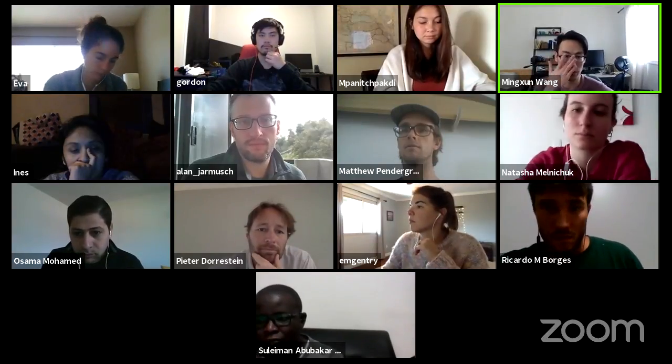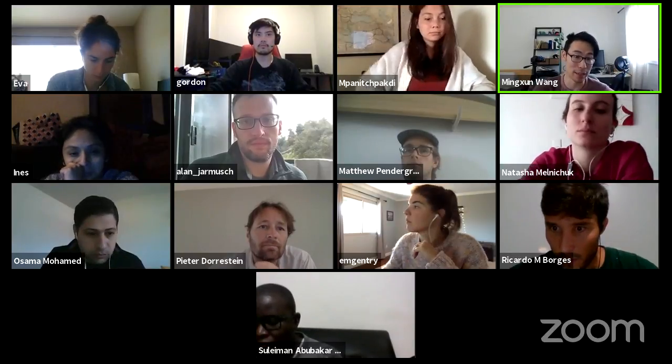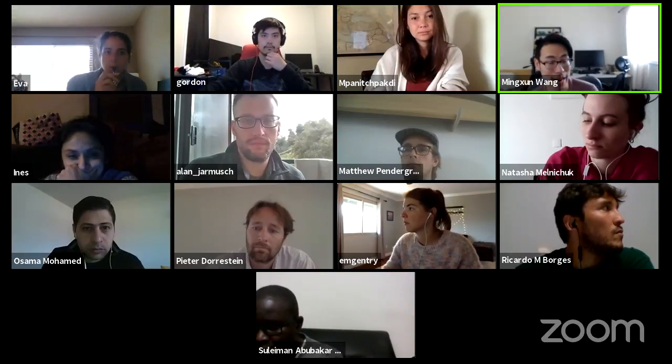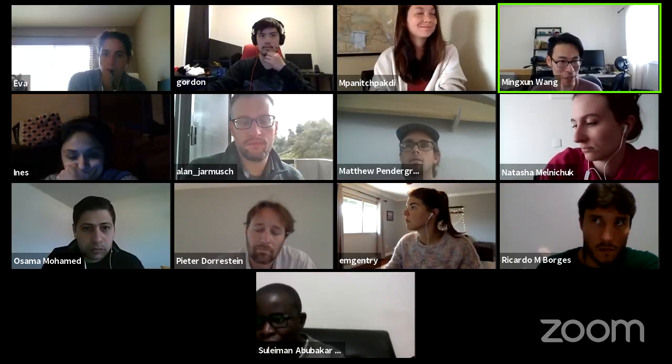And so here are examples of different ways to resolve, but specifically we provide what they call deep linking. So it'll be in whatever resource you're analyzing, like MassBank already links to it. If you're doing an analysis on GNPS and you do a library search, it automatically generates these links for you already. So if you start seeing it showing up, you're like, oh, okay, that's a thing. But in order to source the data, it has to come from some web resource. So GNPS is one, but if it's local, there's no server running on your local system. But anyway, something to think about.